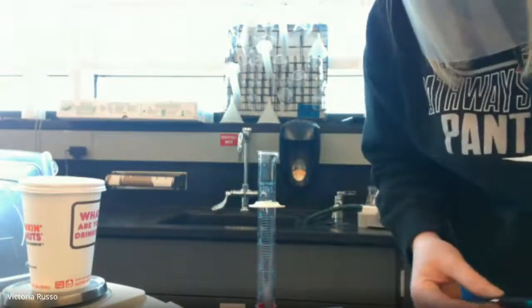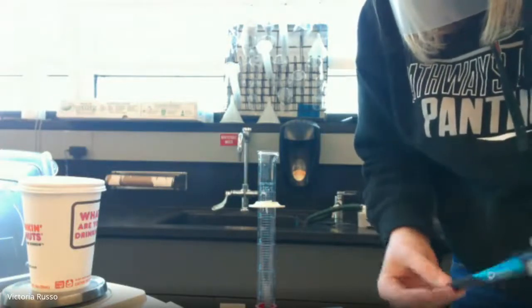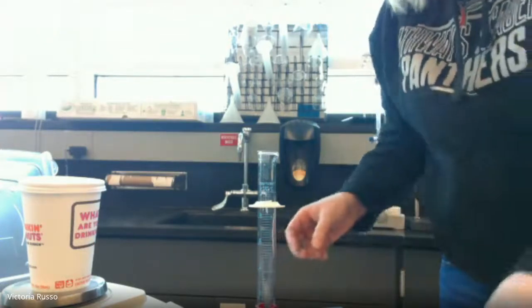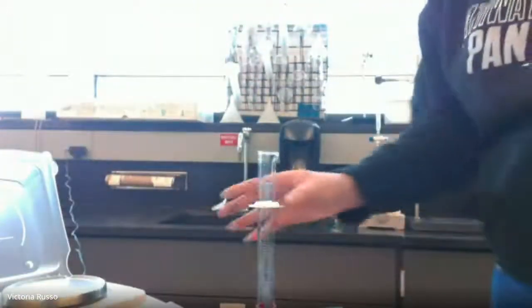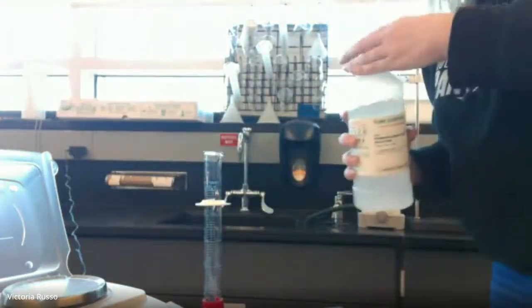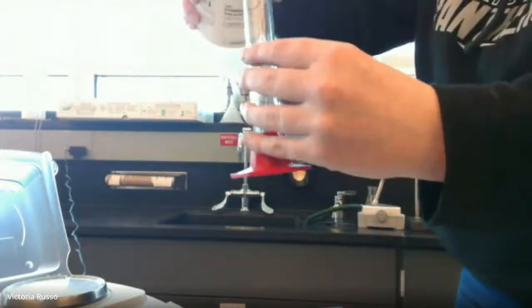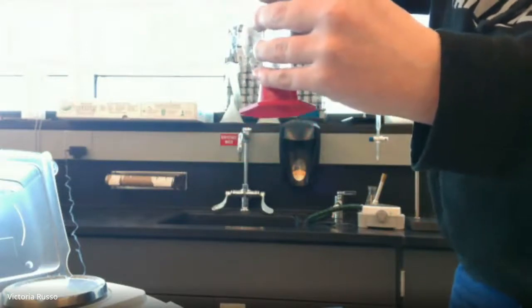All right. So now we look at the instructions next. It says to remove it from the balance and pour approximately 40 milliliters of hydrochloric acid into it and weigh it again. Record these masses on the table. So here is again my calorimeter, and here is my graduated cylinder. And if you look here, this is the 1 molar hydrochloric acid.